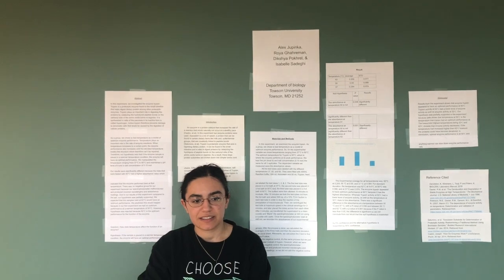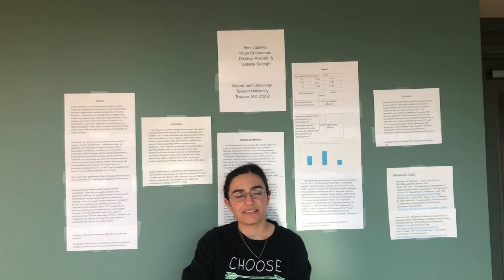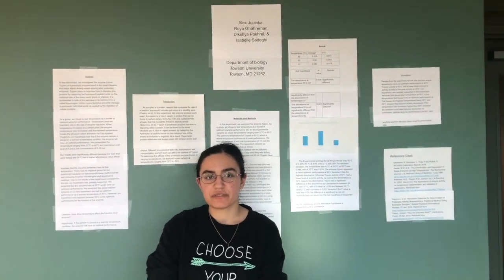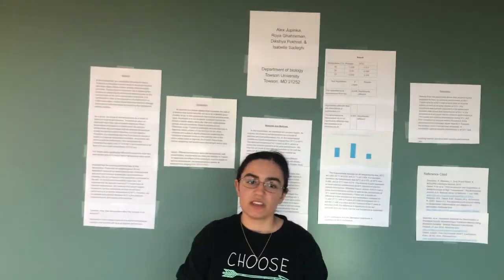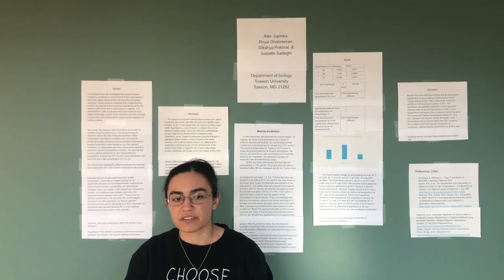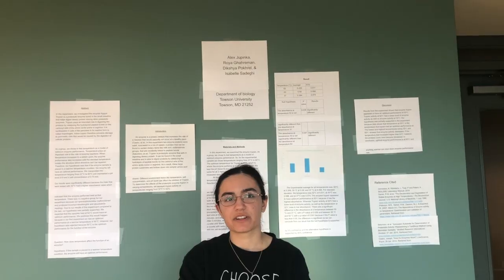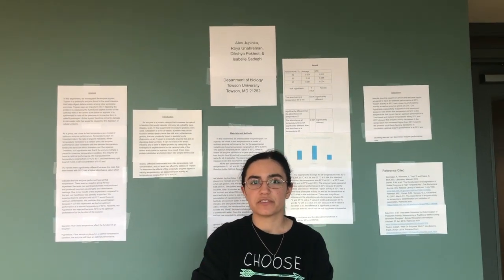500 milliliters of TCA to each test tube to stop the reaction. Next we centrifuged the test tubes at maximum speed for 3 minutes. After 3 minutes, we transferred the supernatant to clean cuvettes and blanked the spectrophotometer at 440 nanometers with new cuvettes with water. Then we recorded the absorbances of our experimental groups once the spectrophotometer reached 440 nanometers.